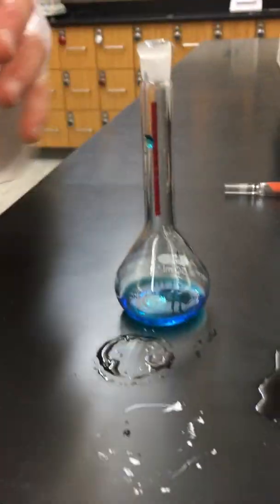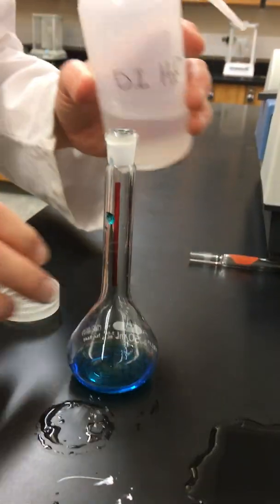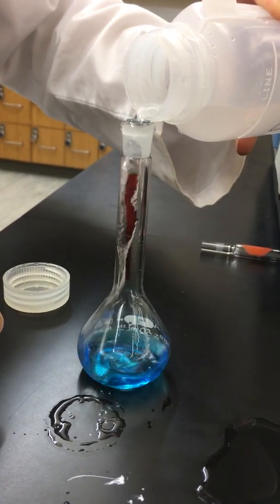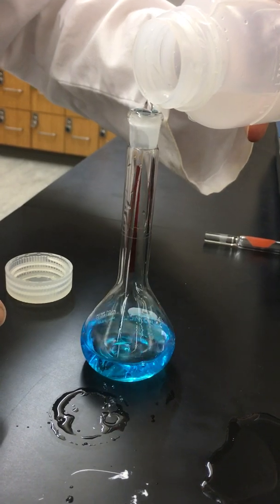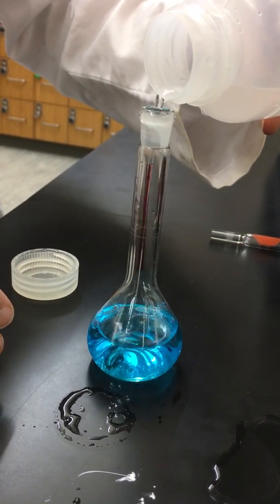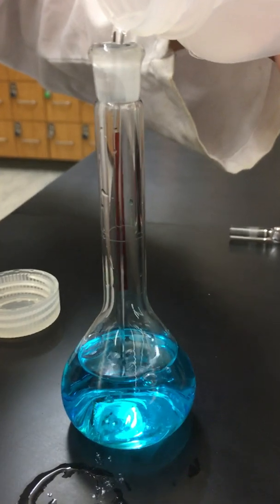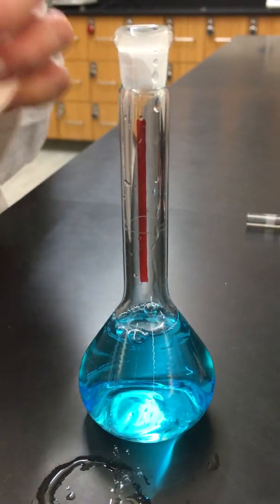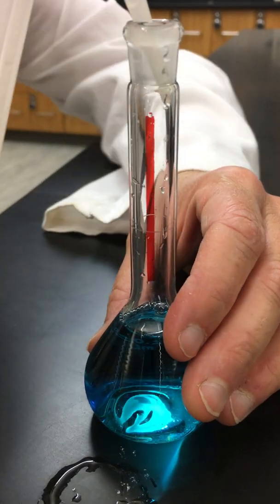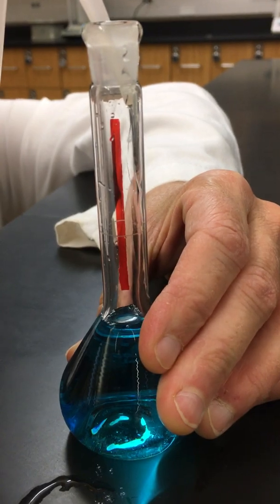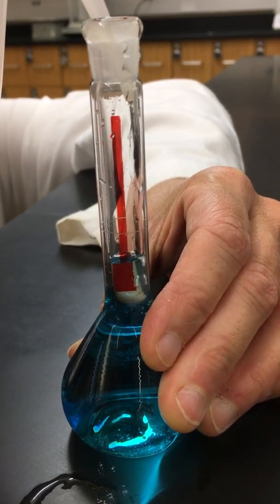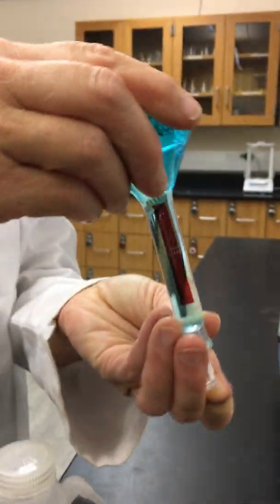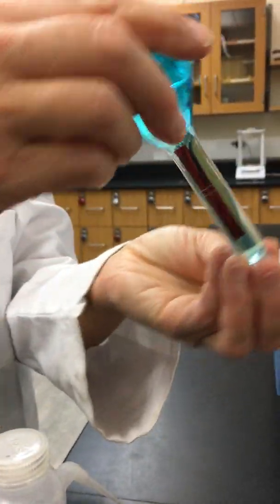Now we'll do the same thing for our next one. And again for that last little bit we'll add it slowly to make sure we have the bottom of the meniscus going right to the line. Mix it to give us a nice homogeneous mixture.